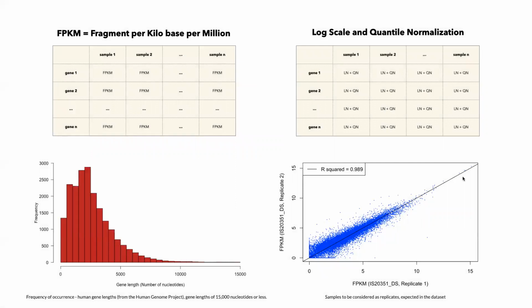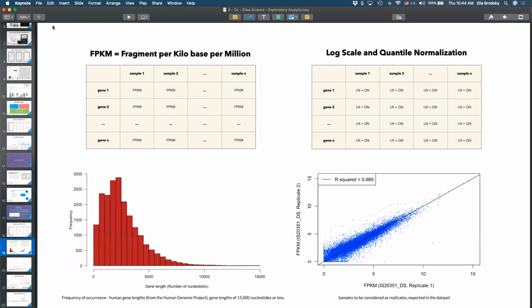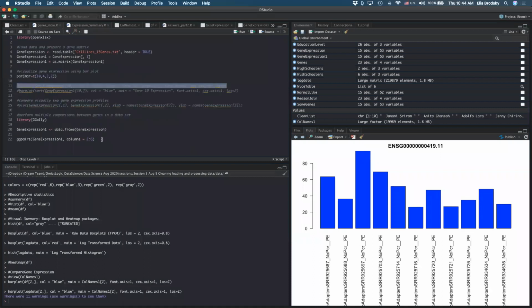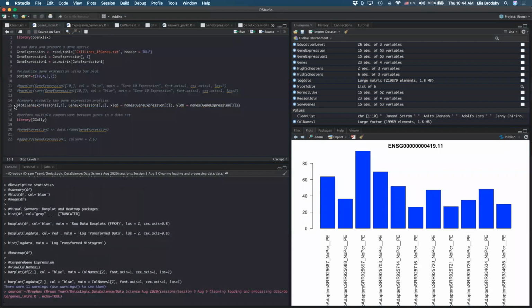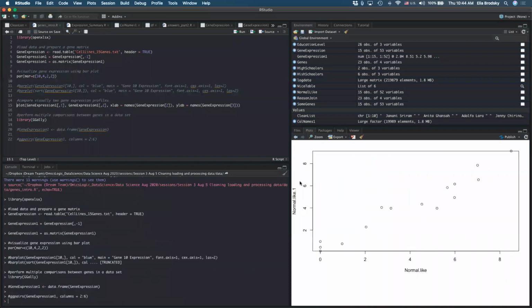When we did that yesterday, right, I'll just quickly show you here an example from yesterday of what we did. What we did here, right, is the following. We did a scatter plot. And what did the scatter plot show us? The scatter plot shows us a comparison between expression of a normal-like sample and a normal-like sample.